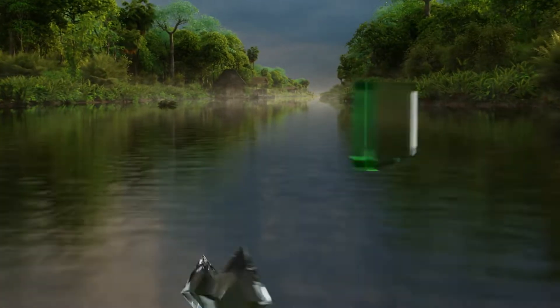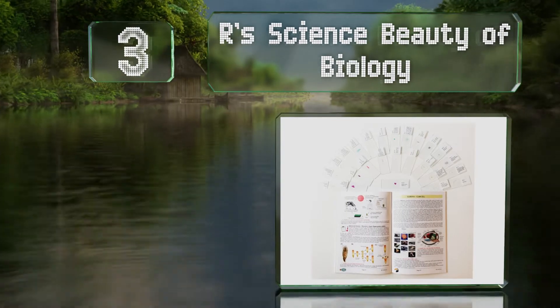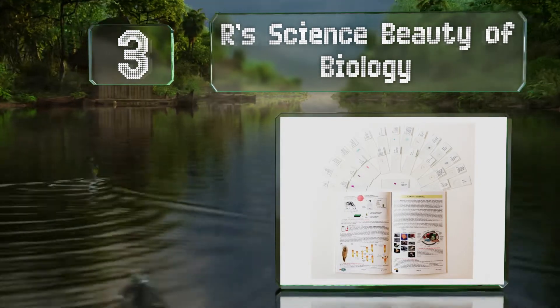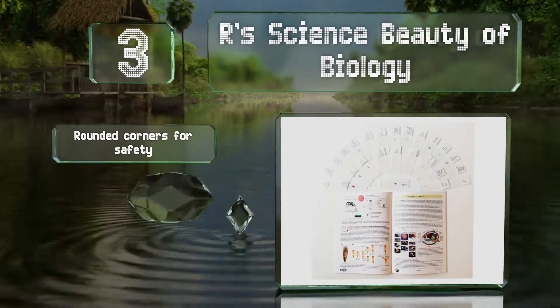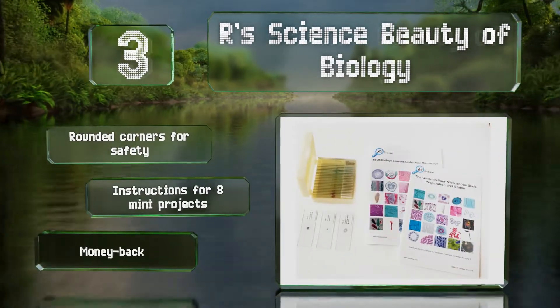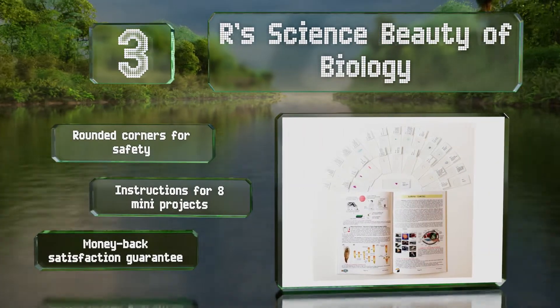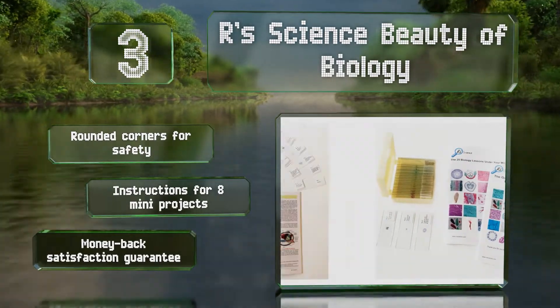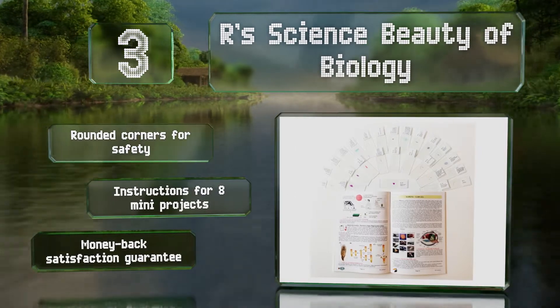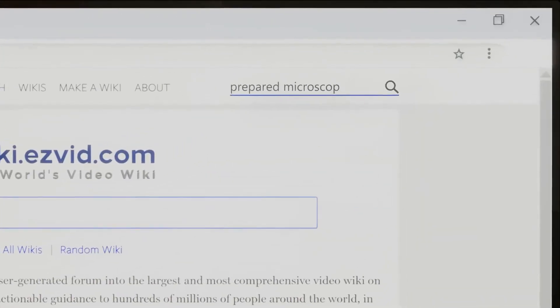Nearing the top of our list at number three, with the R Science Beauty of Biology you'll get to examine algae, fungi, plants, and the tissues of animals and humans. A professionally written guidebook is included that contains colorful pictures and detailed descriptions of the anatomical structures. These have rounded corners for safety and come with instructions for eight mini projects, along with a money-back satisfaction guarantee.